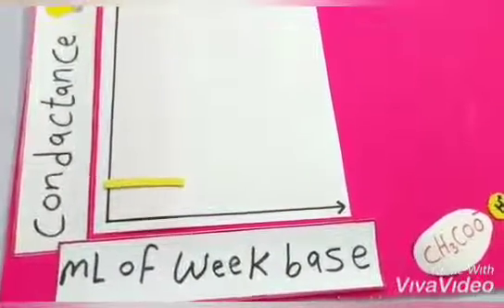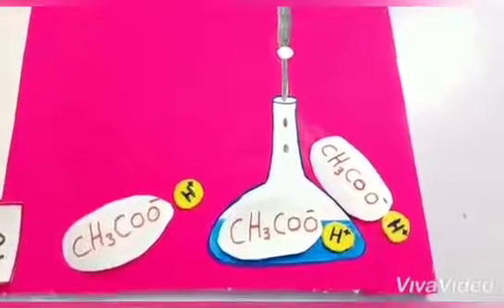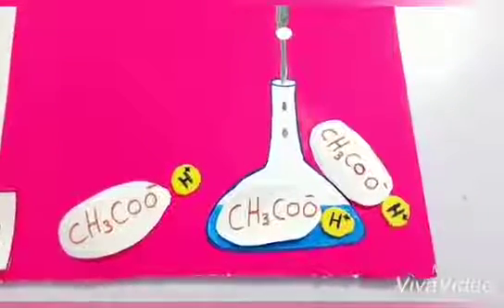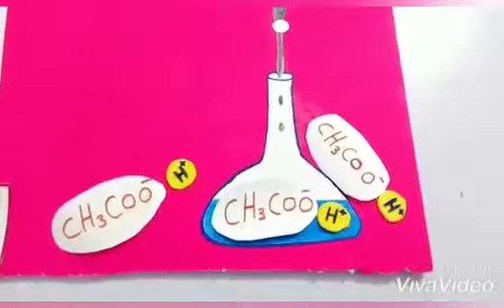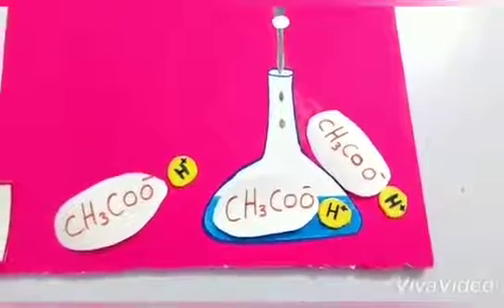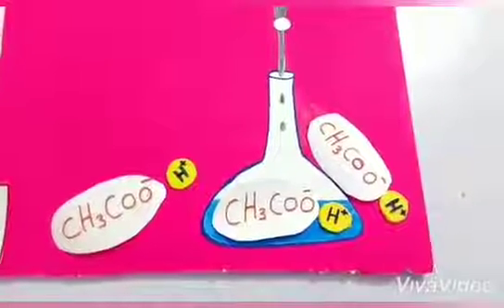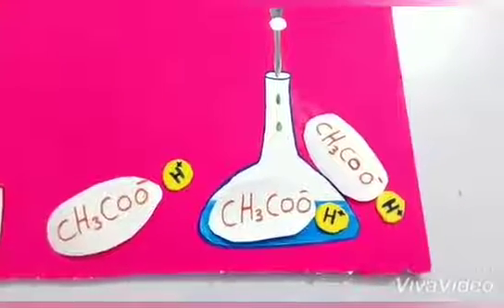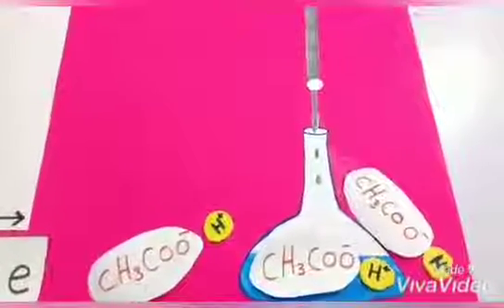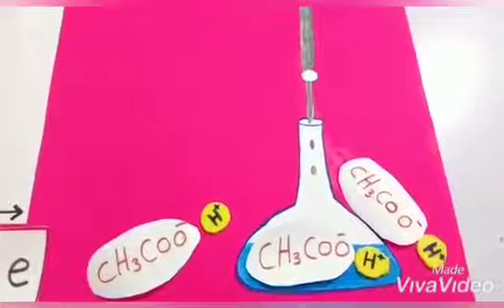With addition of a weak base to the solution, the conductance will decrease more, and this decrease is due to the common ion effect, which acts as a buffer. With addition of a larger volume of weak base, this will lead to increased ionization, and so increased conductance. And after that, we will reach the equivalence point, and the equivalence point becomes part of the curve.